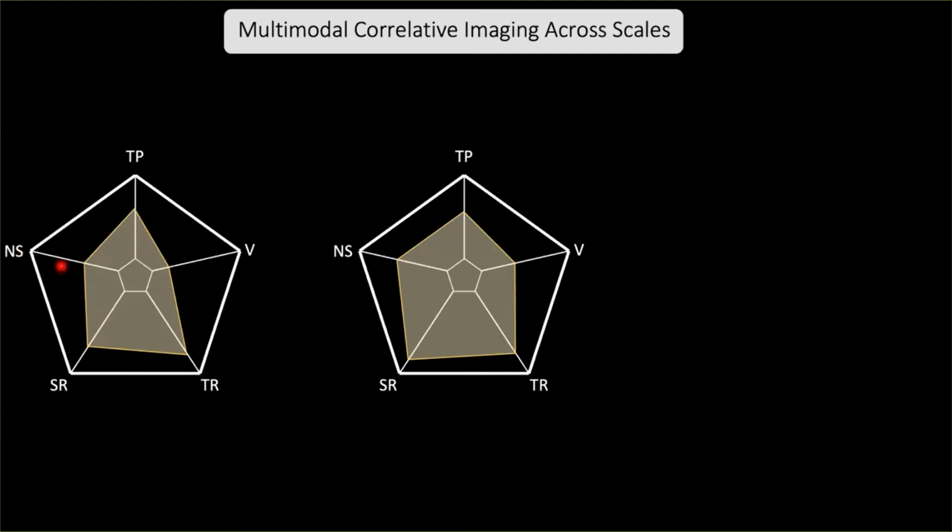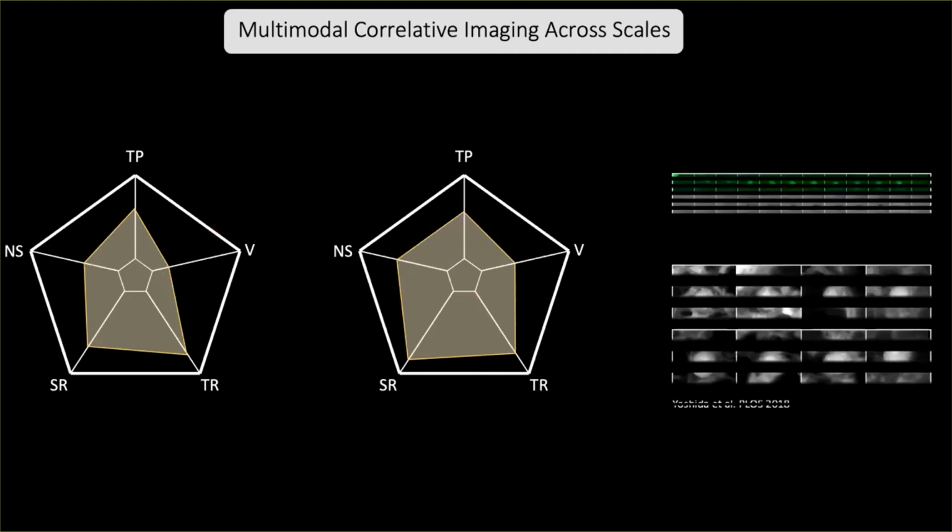The native state, I would say, is a bit less because the cells have been unroofed and the cytoplasm has been removed, so the sample undergoes many washes, and these changes are hard to account for. Throughput is relatively equal. Again, one can look in the fluorescence microscope at huge fields of view, see the locations where endocytosis is occurring, and then acquire these sites with the electron microscope. And in terms of the volume, it's again slightly less, as I mentioned.